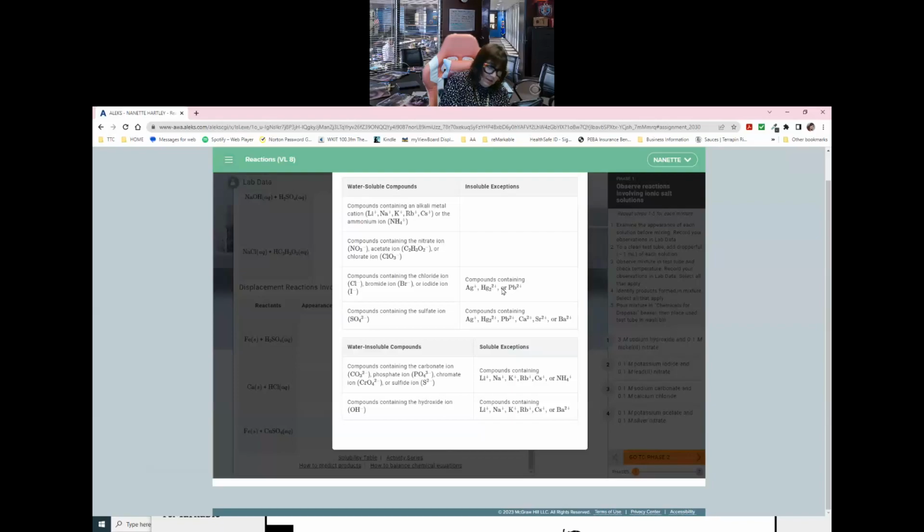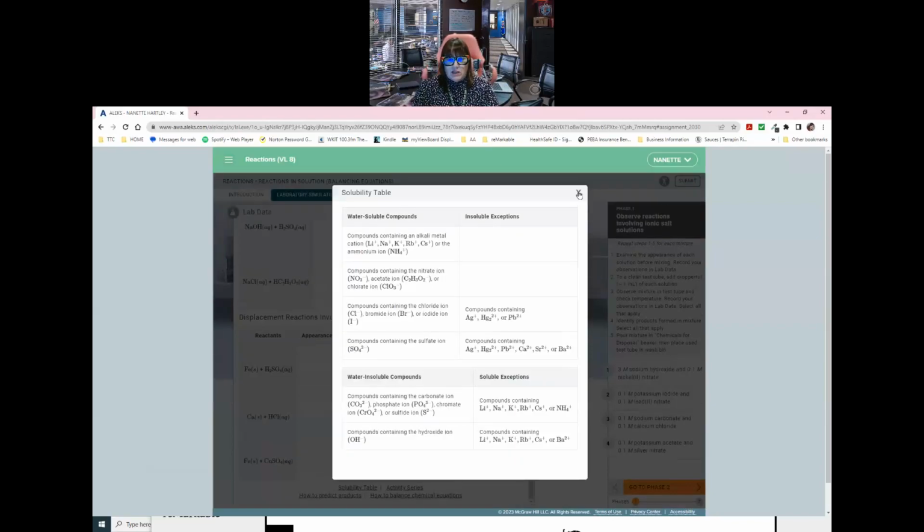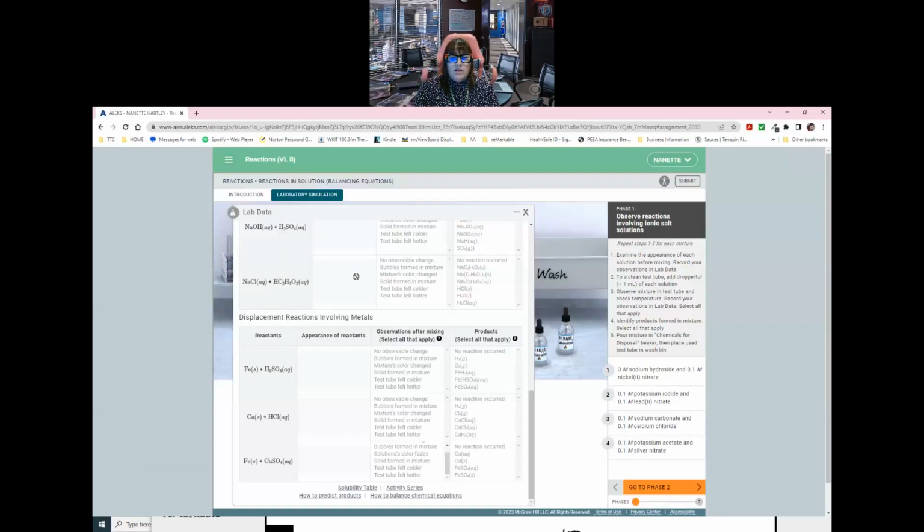I know that both of these are soluble because this is an acetate ion. So that acetate ion is soluble. And of course, the Na plus and the acetate are soluble as well. So this is an aq. So I would actually expect that nothing's going to happen when I mix these two things together. Okay, nothing that I can see anyway.